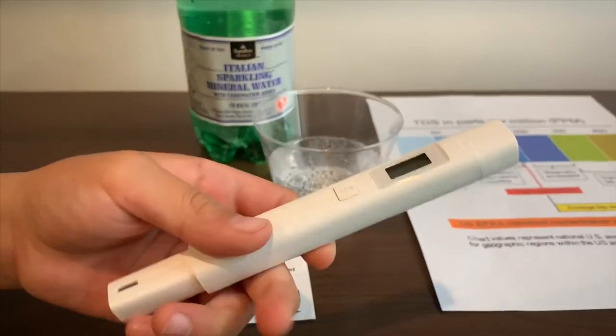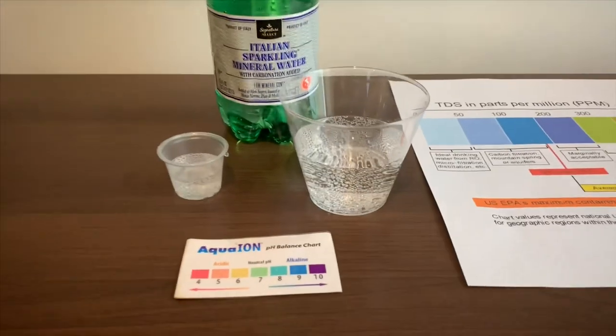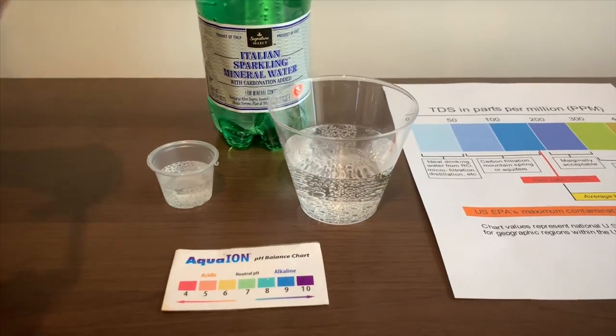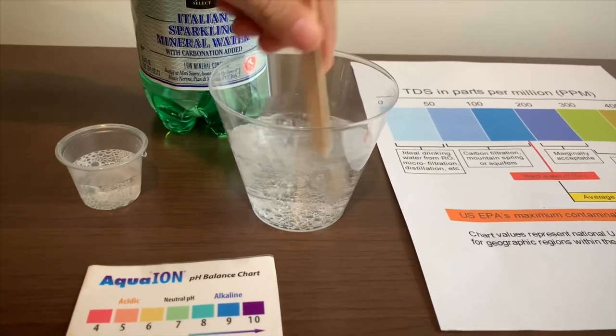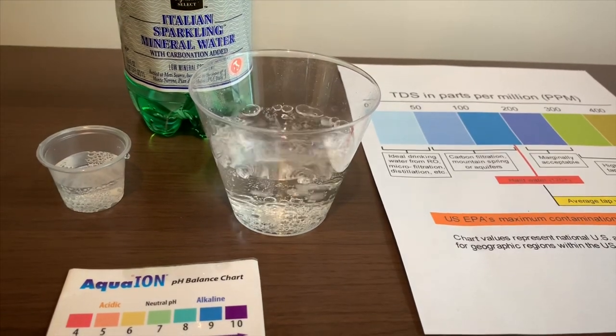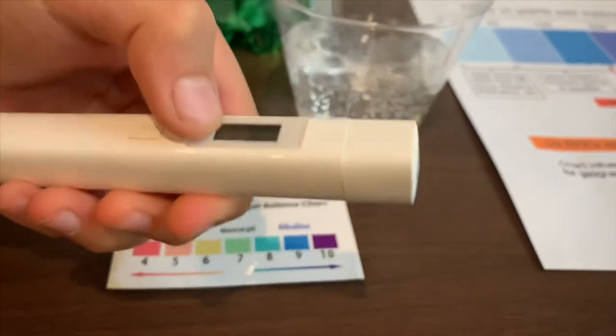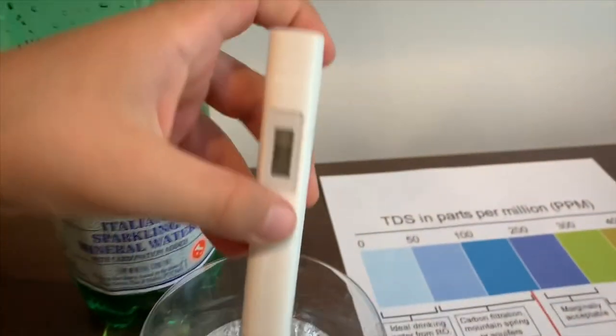If you want to buy this TDS Tester, check the link down below. Let's first stir it a little so we'll get a better result. Turn on the TDS Tester, make sure it says zero, and put it in.